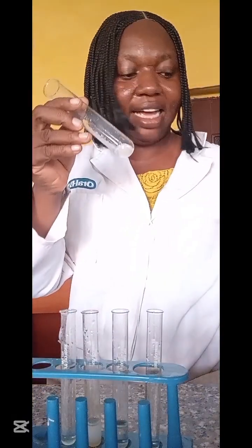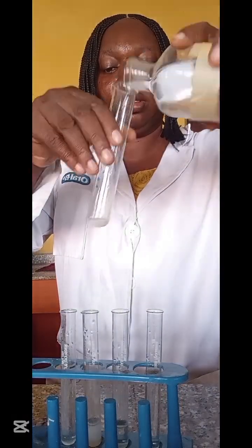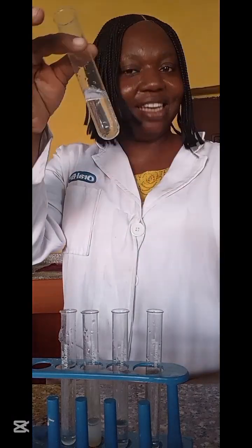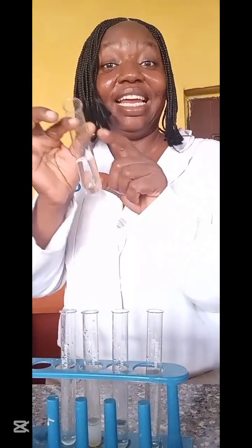So let's test that lead using sodium hydroxide. In drops, still a white chalky precipitate. In excess, can you see? Dissolves. So that is lead 2 ion.